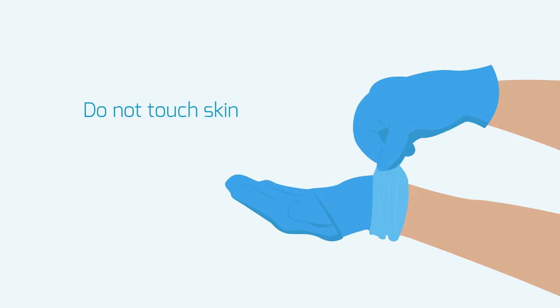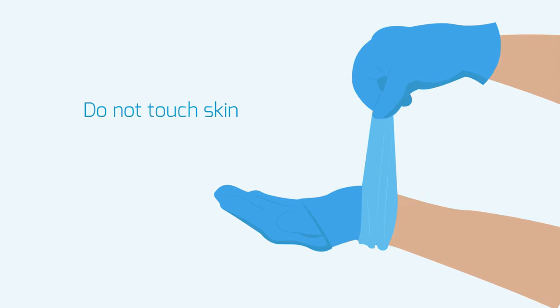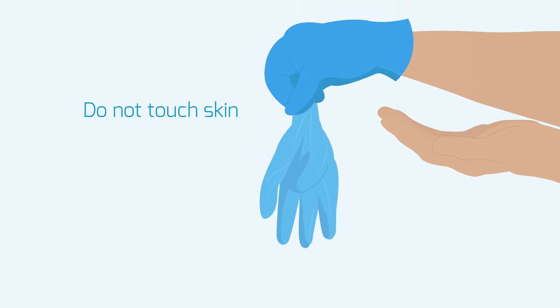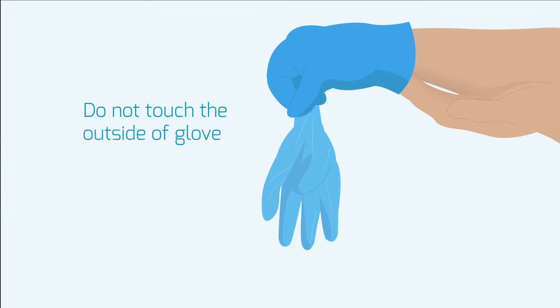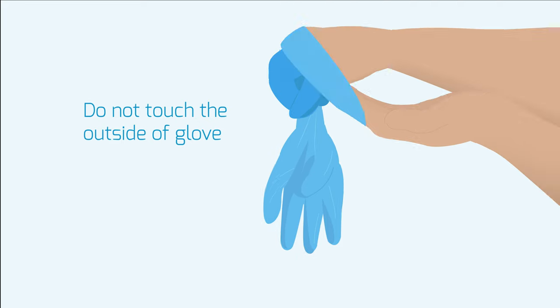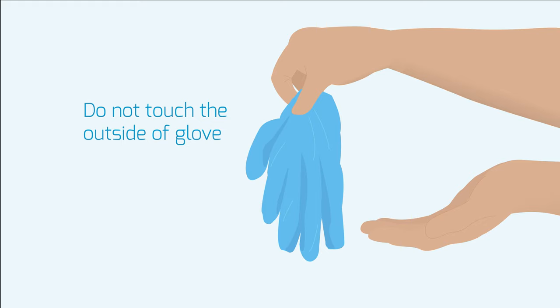Remove gloves first. Pinch one glove at the wrist without touching the skin of the forearm and peel away from the hand, turning the glove inside out. Hold the removed glove in the gloved hand. Hook the index and middle finger of the bare hand inside the remaining glove, taking care not to touch the outside of the glove. Pull off the glove, turning it inside out with the first glove inside.